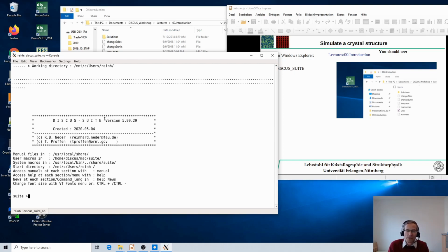DISCUS program. Some of you may be familiar with programming languages, for example Python, that is fairly popular these days. Think of the command language in DISCUS as something like a programming language, except in contrast to Python, this was invented some 30 years ago when I started the DISCUS program. So with that, let's start.